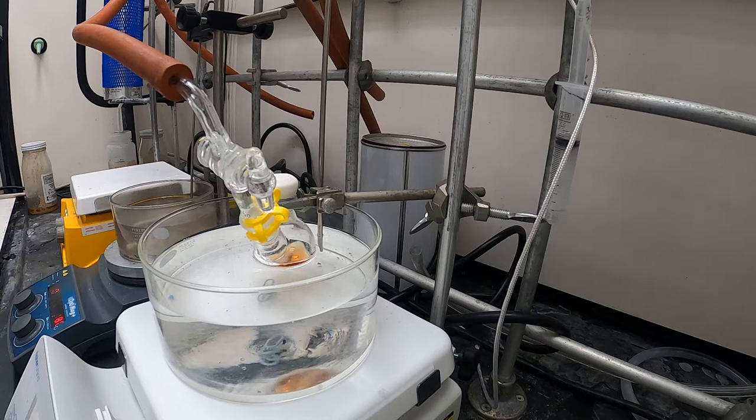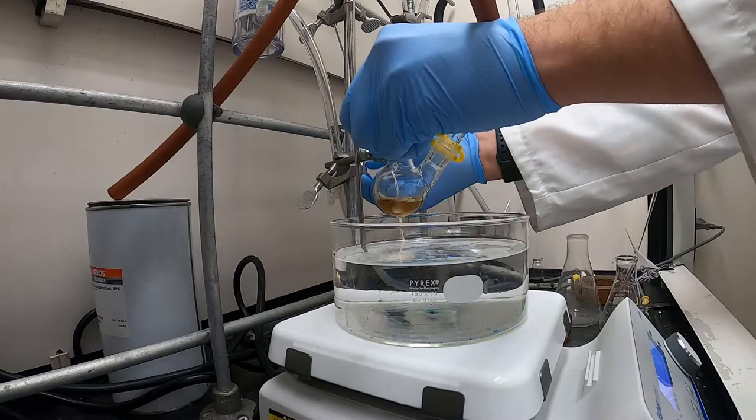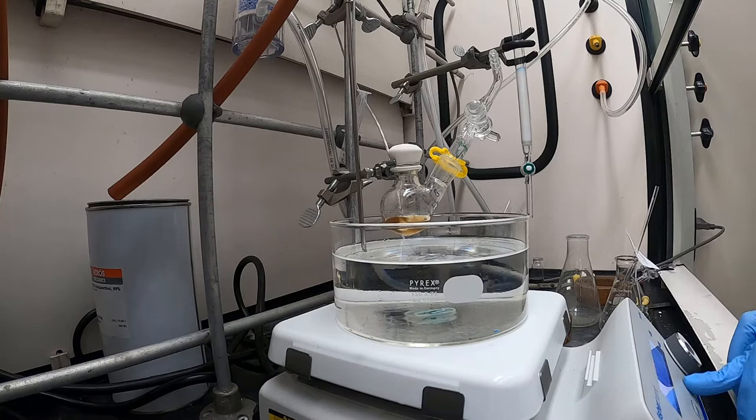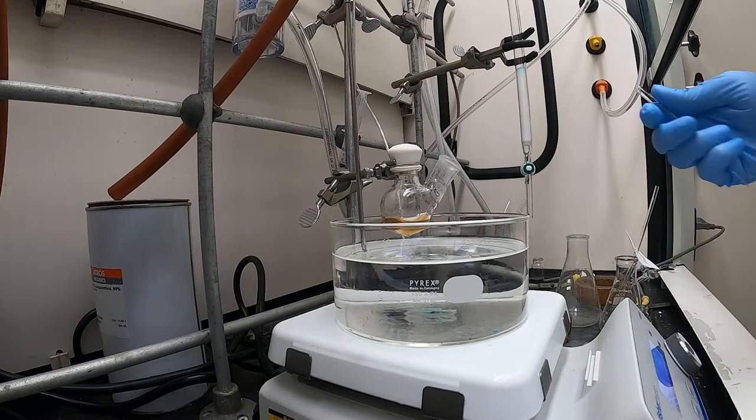To monitor the progress of the polymerization, I use the glass syringe with a needle to remove a small portion, and use proton NMR to determine the monomer conversion and approximate the polymerization rate. Once the polymerization reached the desired conversion or molecular weight, I removed the flask from the oil bath, opened the flask to air, and took a small portion for one final NMR. Lastly, I diluted the reaction mixture with THF.